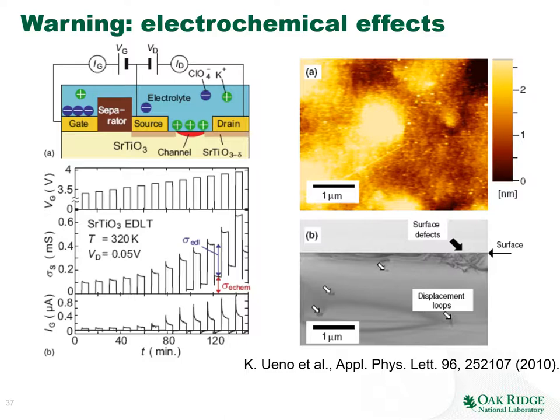Now, a note of warning. So you may have noticed that over and over again, when I talk about the polarization switching, I always warn about the electrochemical effects. And the question is, how likely are those effects? So in the end, we are talking about crystalline ferroelectrics. Shouldn't they be stable? And the answer is no, they are not.